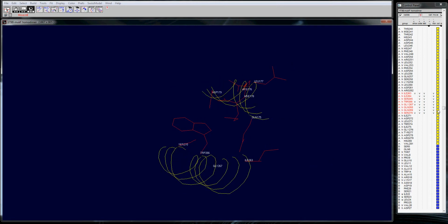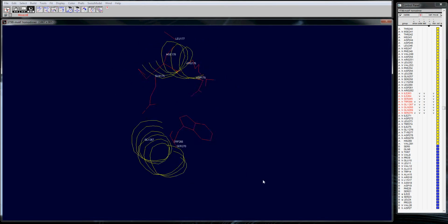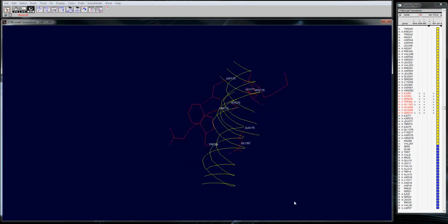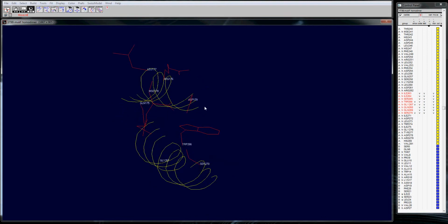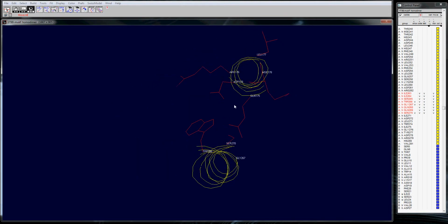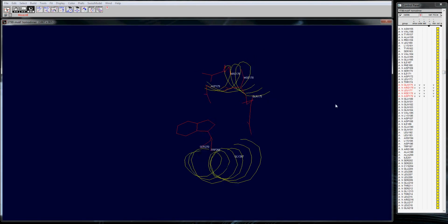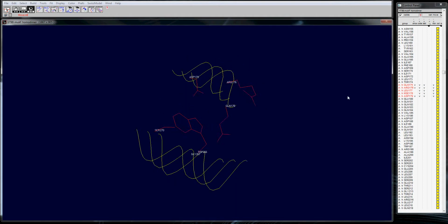And if it's pointing away, it's probably not interacting with it, which means it's not interesting, which means that if we randomize that amino acid, it won't give us anything interesting library-wise. That arginine 176, this guy looks like it might be doing something, so I'm going to leave it. 177, obviously not doing a darn thing, so gone. 178, gone.